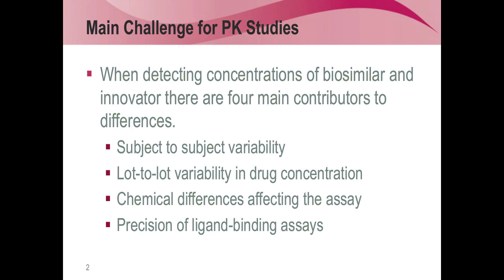And a major complication, which is not really specific to biosimilars, but simply for doing work on biologics, is the relatively low precision and accuracy of ligand binding assays compared to other methods like biophysical methods. And there's really only 2 things we can work with, so these are the last 2. And I'm going to talk to you about why.